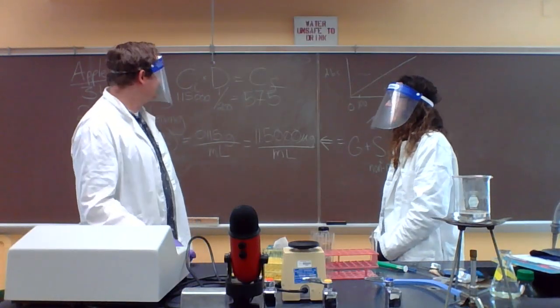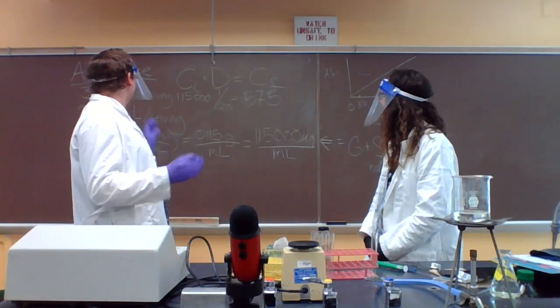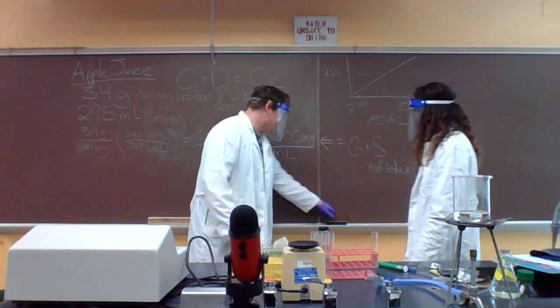Yay! Yeehaw! Students all around the world love serial dilutions. Nobody loves it more than me.